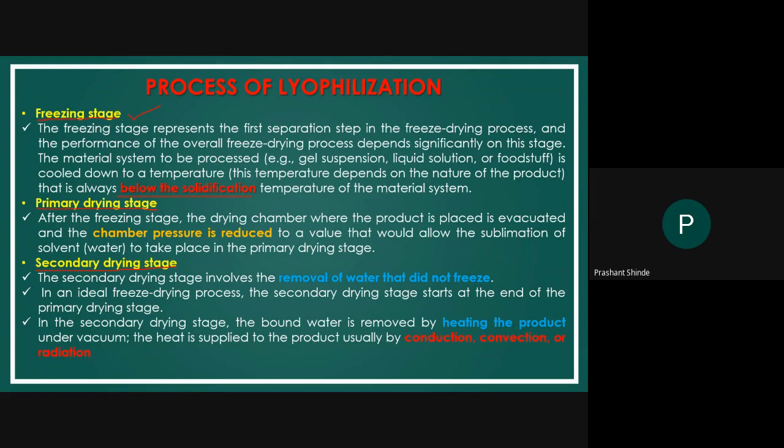Now, when we maintain that temperature, whatever water molecules are present in that sample go into the frozen form. So this is nothing but your freezing stage. After the freezing stage, the second one is your primary drying stage. In the primary drying stage, we are going to reduce the pressure inside the chamber of this lyophilization instrument.